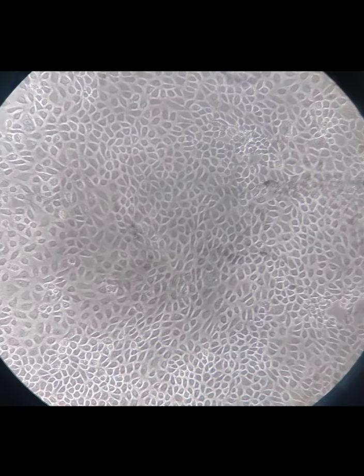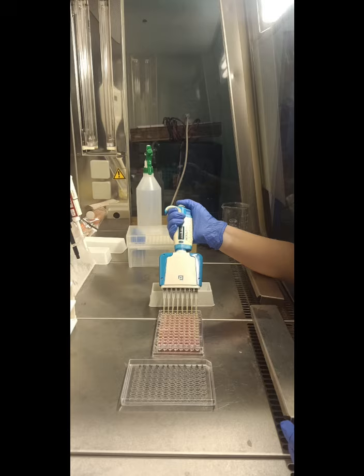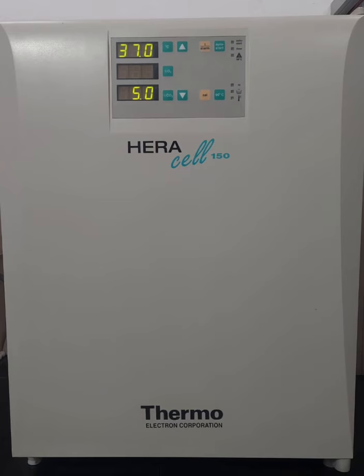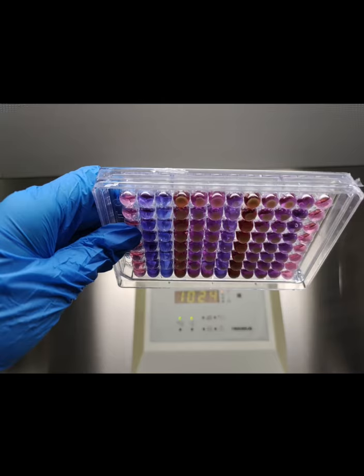Once the flasks reached a confluency of 97 to 99%, the cells were trypsinized using trypsin EDTA solution and seeded in a 96 well plate, which was incubated at 37 degrees Celsius and 5% carbon dioxide. After giving the toxicant, we put the 96 well plate in the incubator. After an exposure of 24 hours, we added our dye, either MTT or resazurin, and kept it for 24 hours in the incubator.